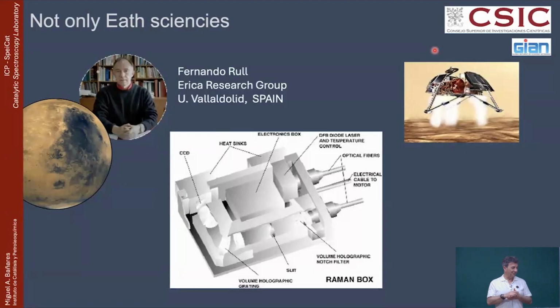How can we cancel the fluorescence? Okay, that's a very good question. There are several ways. Typically, fluorescence may have different origins. Sometimes it's a compositional origin. For instance, aluminas have a tiny amount of chromium atoms within the alumina lattice, and those generate fluorescence. So there are some aluminas that will always produce fluorescence no matter what you do, and you cannot get rid of it.